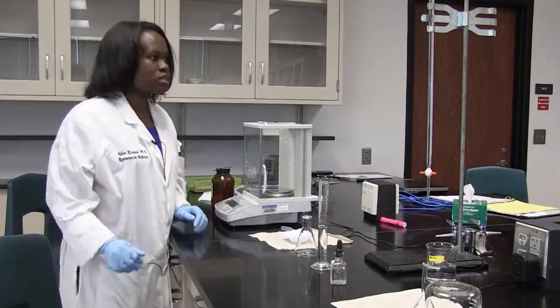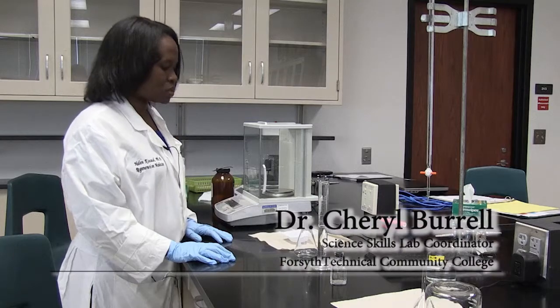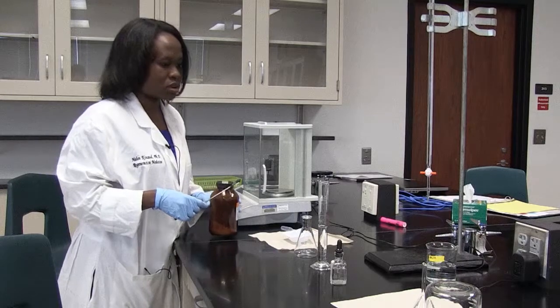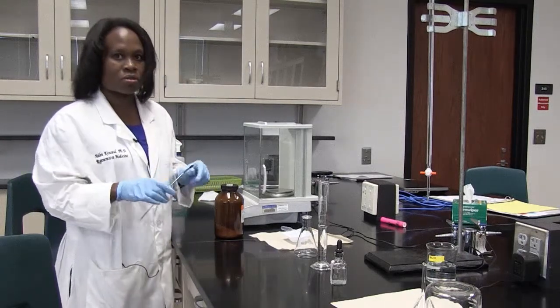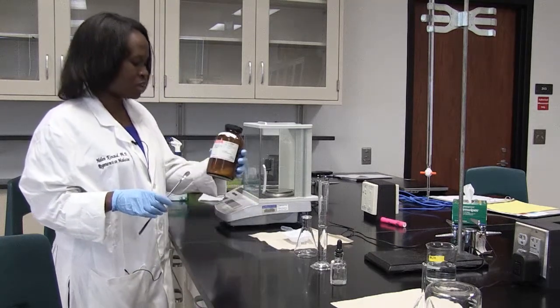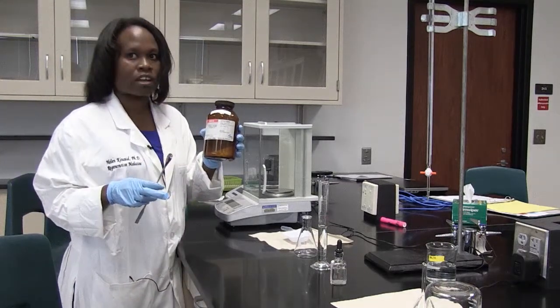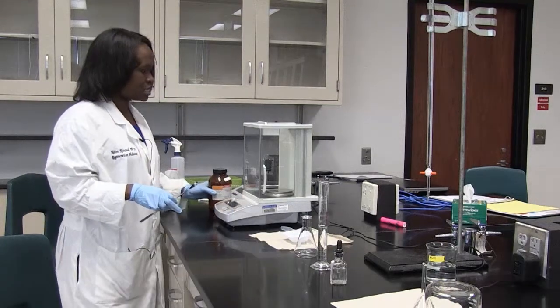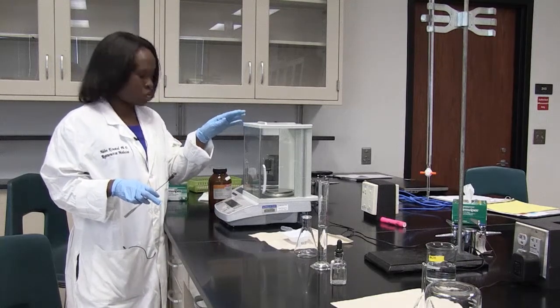Okay, so we're going to start our standardization procedure. If you remember, we're going to determine the concentration of our base, which is sodium hydroxide in this case, by using a known quantity of potassium hydrogen phthalate. And this is potassium hydrogen phthalate. We're going to use 1 gram of this acid, and we're going to use this analytical electronic balance to determine the weight of our acid.